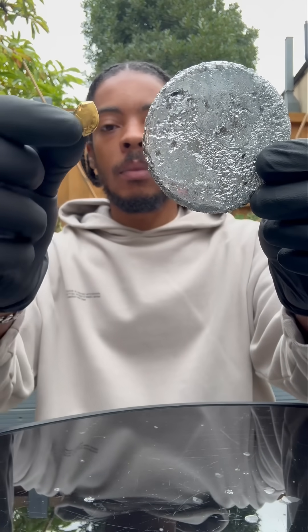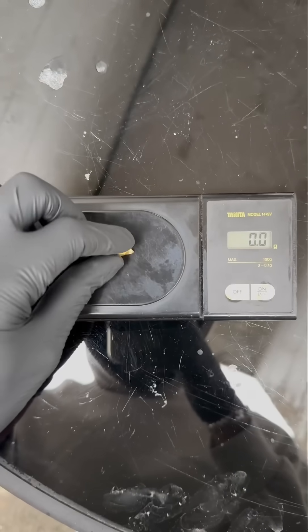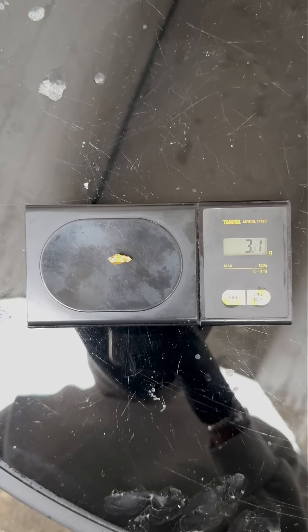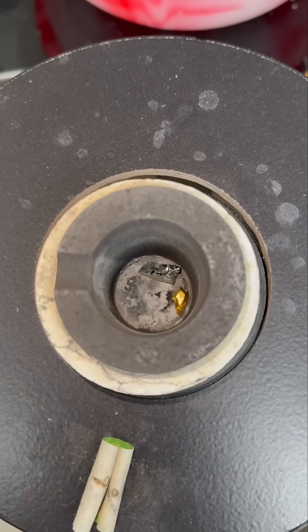We've got some gallium metal and a little piece of gold, and we're going to melt them down together to make some blue gold. First we've got to weigh them up in a 50/50 ratio, then we slap it into the furnace so we can heat it up.